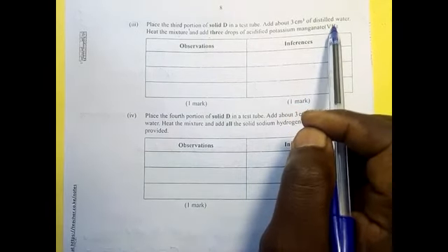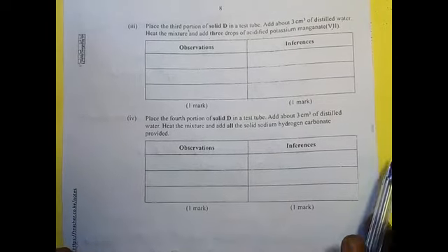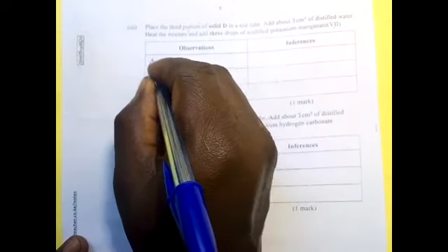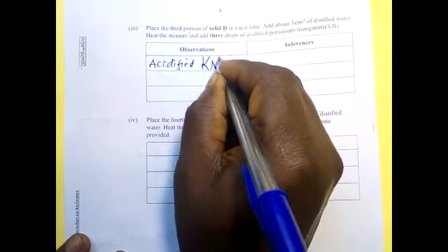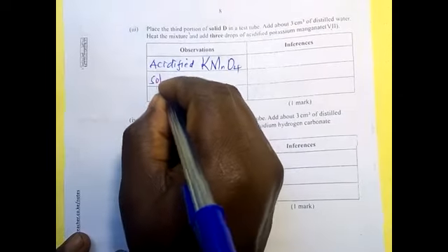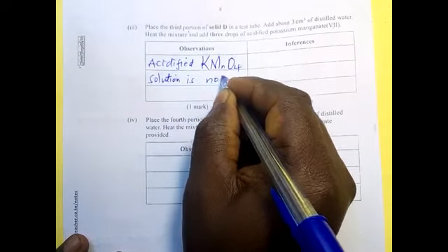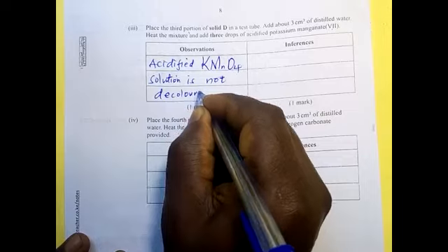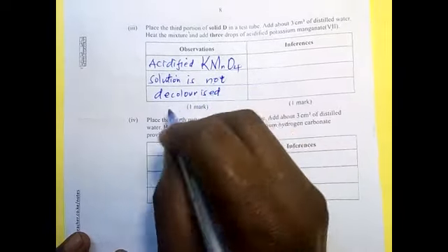Then the observation is that the acidified potassium permanganate solution is not decolorized. We have reviewed that it did not decolorize.